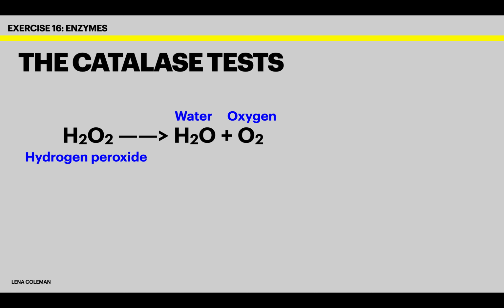In this activity, we're going to do a run-through of the catalase tests and the urease tests in order to provide some figures and some animations that would go along with completing your lab report 16. So first of all, let's talk about what the catalase test is again as a recap.